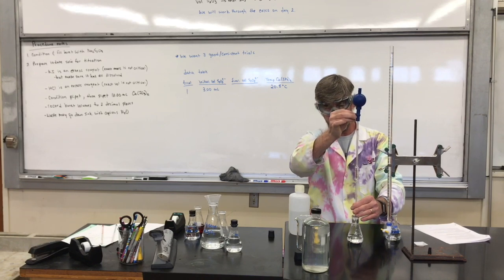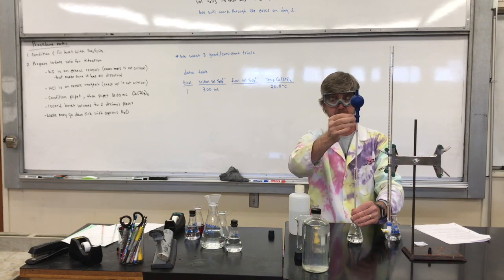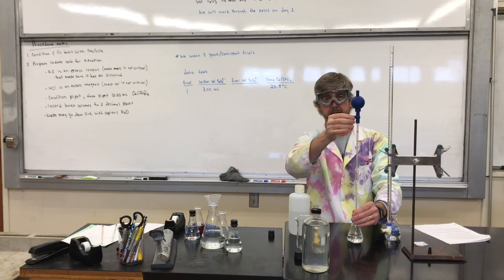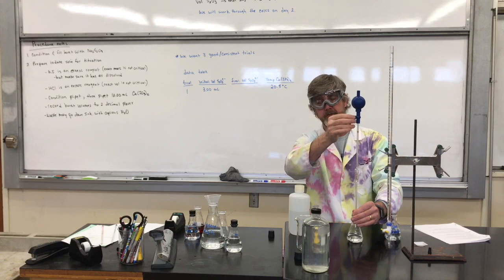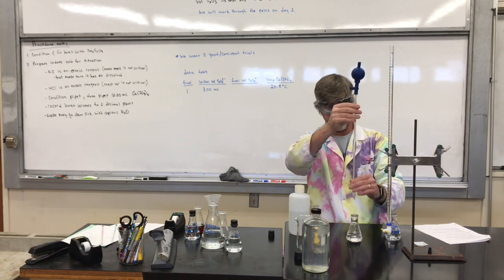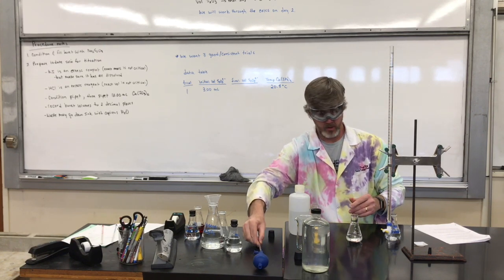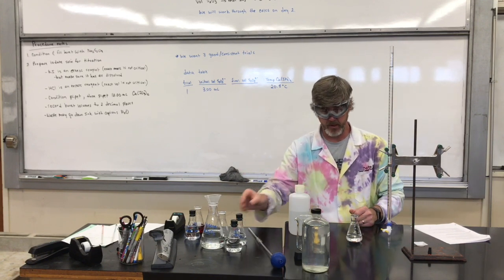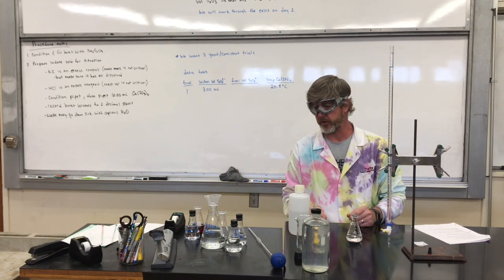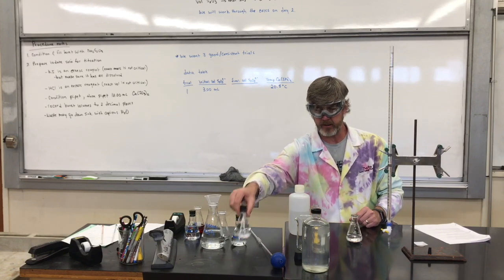And as I'm letting this drain, I'm just going to wait a few extra seconds to make sure any of that extra liquid can drain down the inside glass walls of the pipette. And you'll usually see, if you wait 10 or 15 seconds, 1 extra drop or so come out of that pipette. Put my lid back on my calcium iodate. We need about 10 mils of HCl, and again, HCl is in excess.